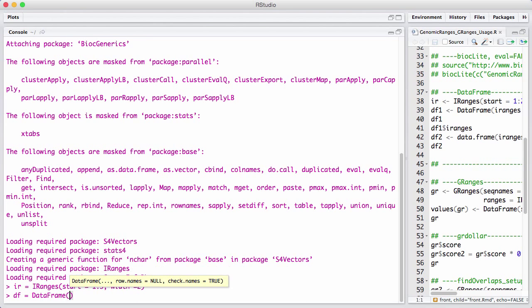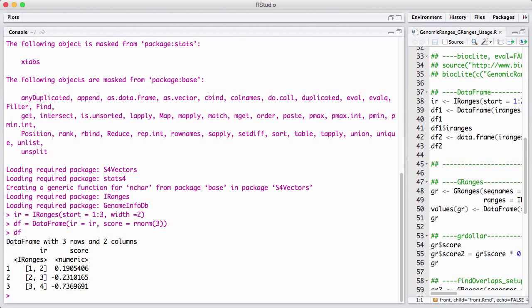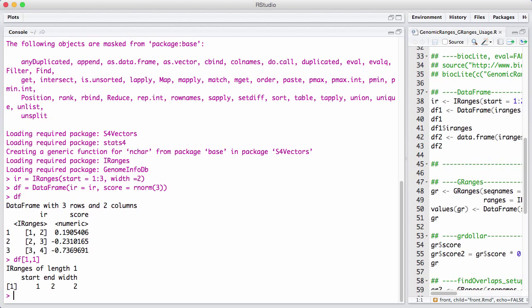You construct them with the capital DF. You can have an IRange here called iR, and let's say we have a score that's three random normal variables. It prints nicely. We can see we have an IRange as a single column, and we can do standard subsetting — this gives us a specific IRange as a length-one object — and we can use the dollar operator as we're used to.